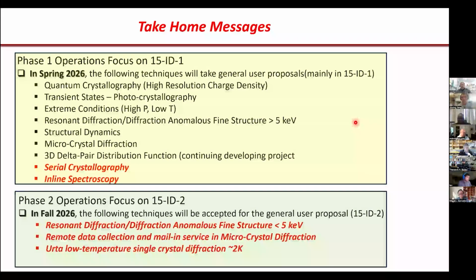Any other people want to have a question? So, Yusheng, how large is the largest size of the beam going to be? Okay, so the largest size beam, right? That depends on what you need. For the capability, we have a CRL, compound refractive lens. Also, we have a KB mirror. Eventually, based on these two, we can go down to about a micron size beam.